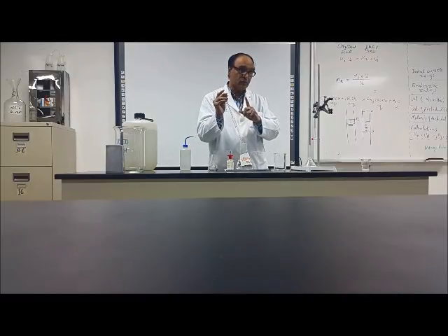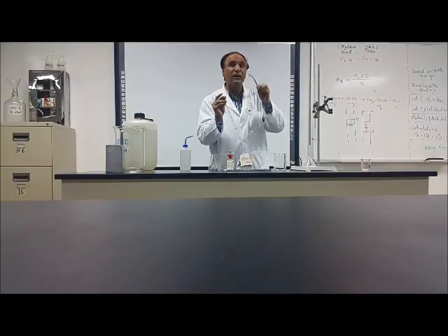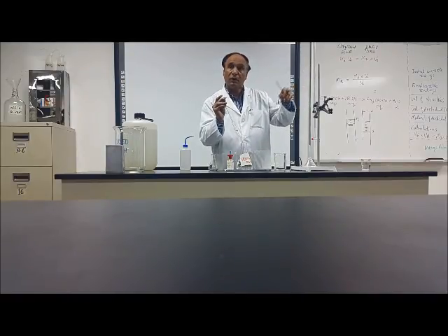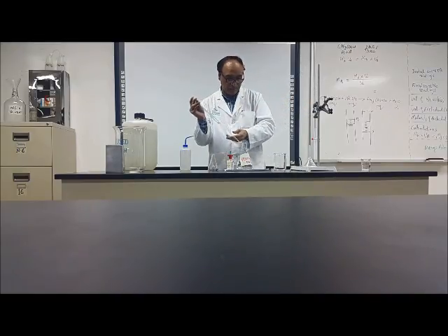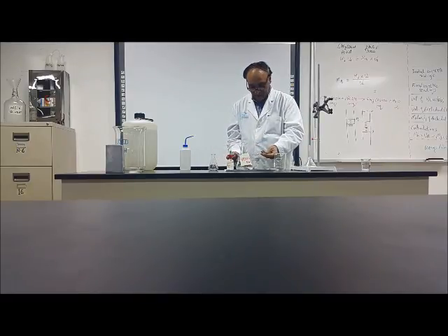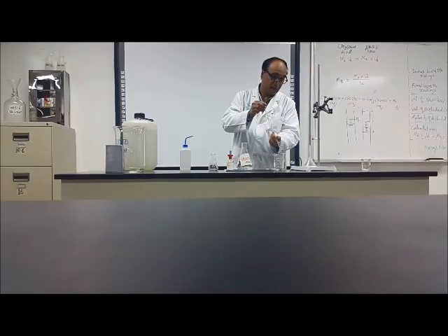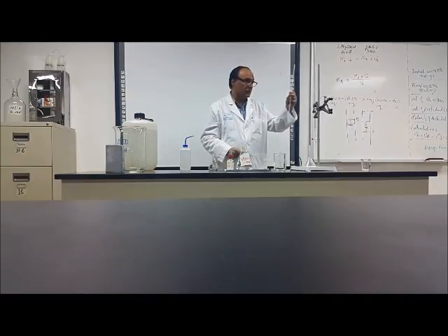This is one student who will be doing this. The other student will do the other part. He will not watch what he is doing. He will not stand waiting for what he is doing. No, he will do his job. I will tell you how he is going to do his job. So, I take this one and I wash it, or you can say I rinse it with this. Right? Now this is ready to be used.